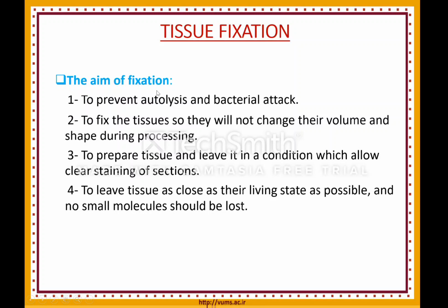The aim of fixation is to prevent autolysis and bacterial attack. You know, in the cytoplasm of the cell, there are lysosomes that include enzymes that, when we remove the tissue or cell from the body, activate, and autolysis or lysis itself occurs in the cell. We fix the tissue so they will not change their volume and structure and shape.